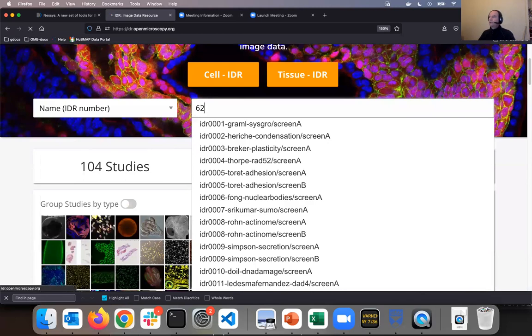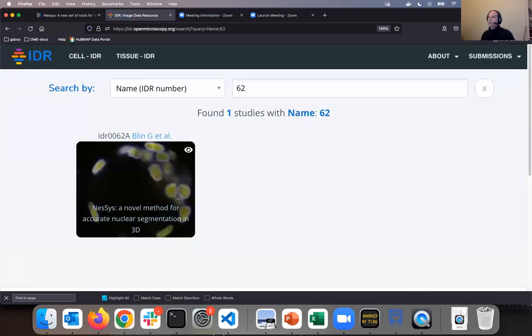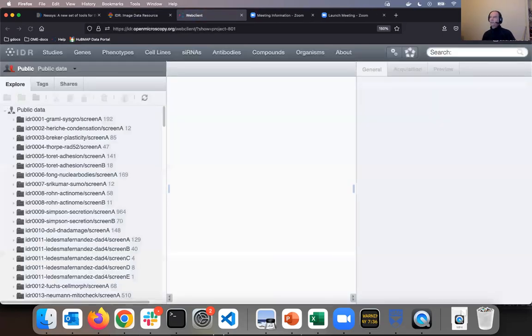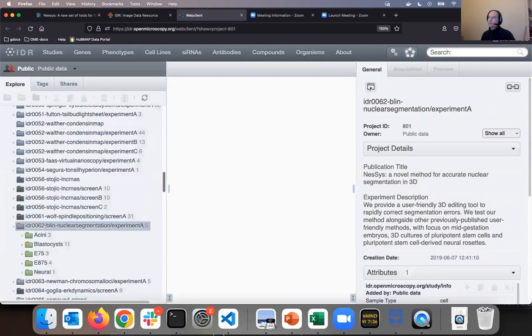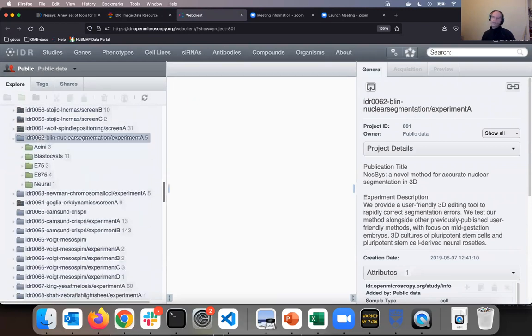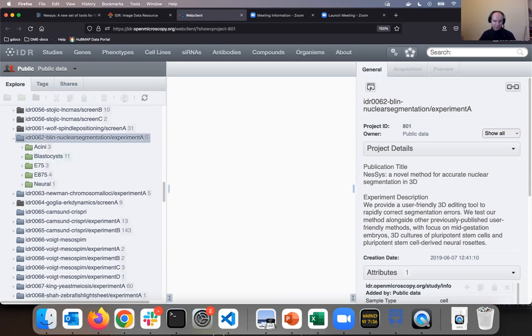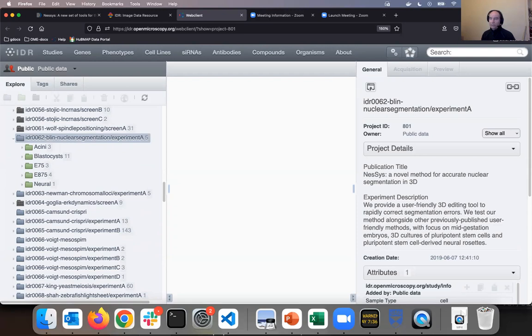So I will search for 62 as highlighted, and this will find me one thumbnail. I will click on it, and I'm re-navigated into the IDR itself. This is based on Omero, the image management software underlying IDR. We call this interface Omero-Web. The study connected to the paper Blin et al I just found on PubMed is selected, and I can read some metadata about it on the right hand pane.